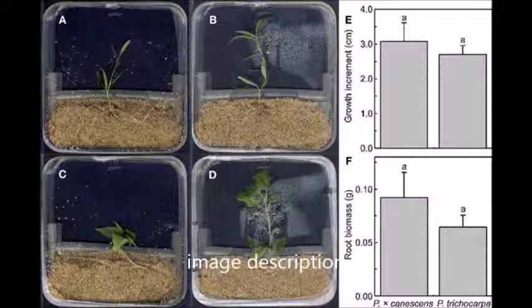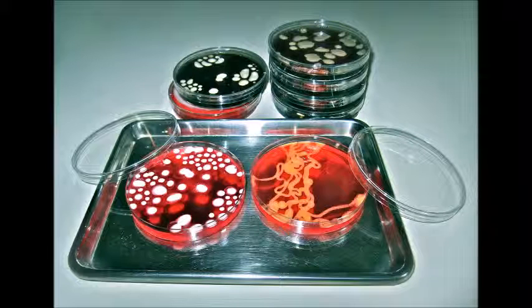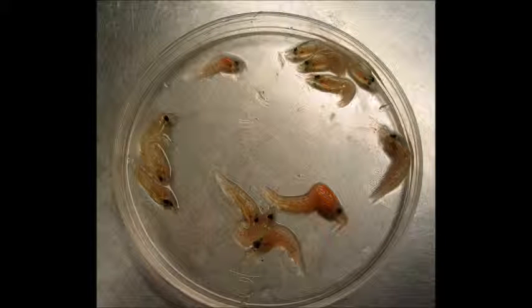Now take a look here in the following slide. As you can see, there is bacteria cultured in the medium agar, as well as regular uses without agar in the next slide here, as you see with these organisms.